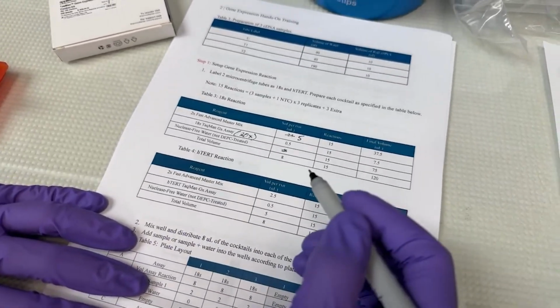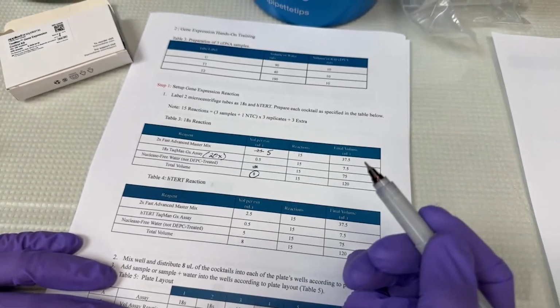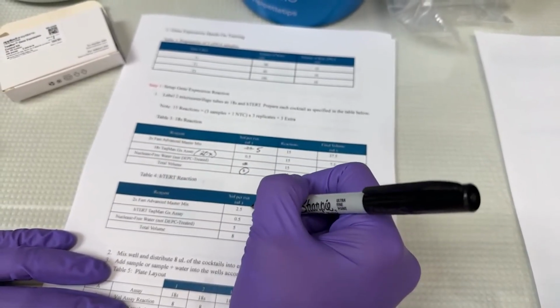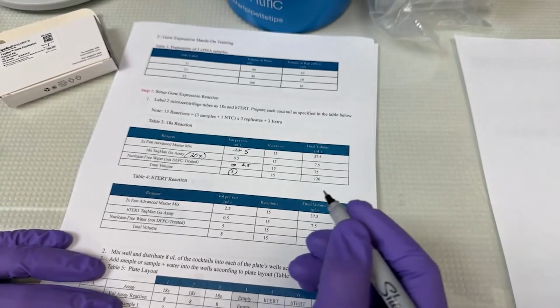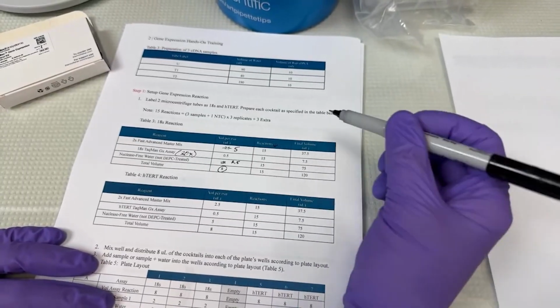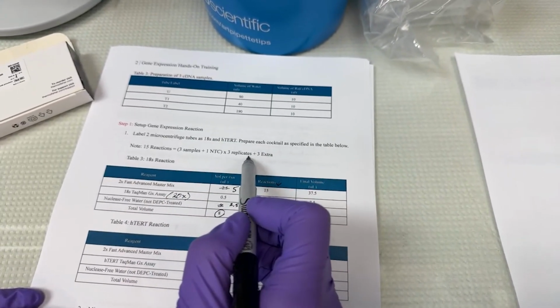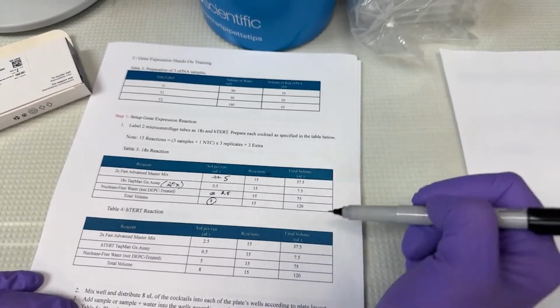I'm going to add 2 microliters of my sample, which means I have 8 microliters for each one of my reactions. So I'm going to aliquot 8 microliters into my individual locations and then add sample to each of those, which means I have 2.5 microliters of water. I'm going to make 15 reactions total. This comes from, again, I have 3 samples. I have 1 no template control. I'm going to run each of those 3 times, and I'm going to make a couple of extra. So we run that out, and we get 15.